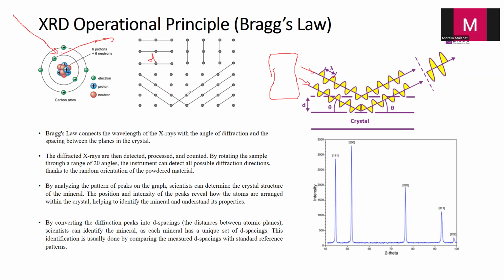It's not going to be nice, but let me try to use this one, for example. Let's say this is 90 degrees, and this will be your angle theta. You'll always agree with me that this is distance d, and the distance d is always the longer side because it's the atomic distance.